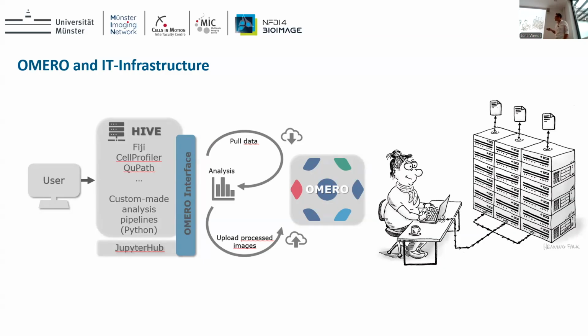And we thought that this might be something that users want to use Omero more, but this is not the case. You tell them that this is possible, they still like to have their data in a folder and do it like this. So this is not something we are doing quite often. We can do it, but it's not asked by users that frequently.